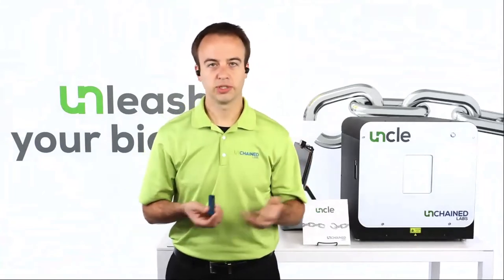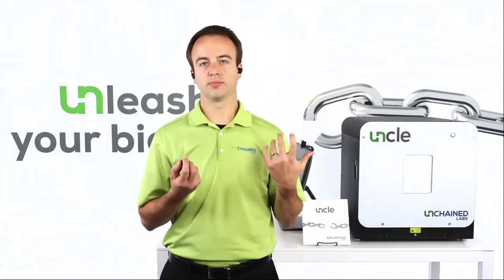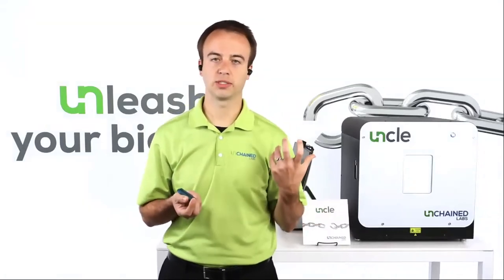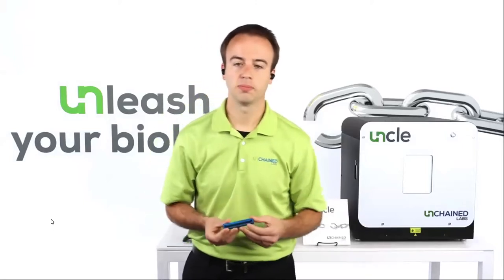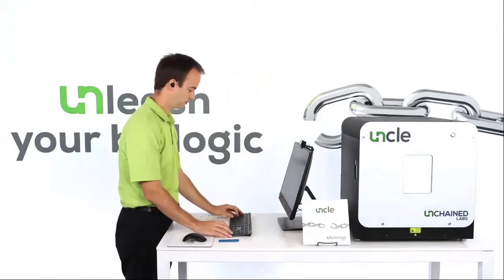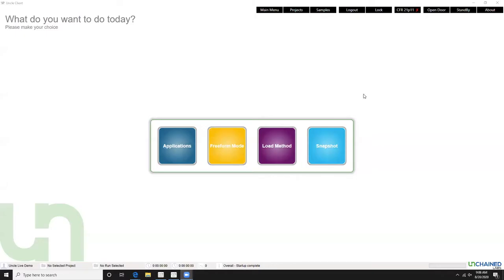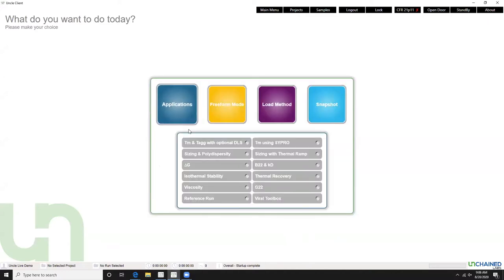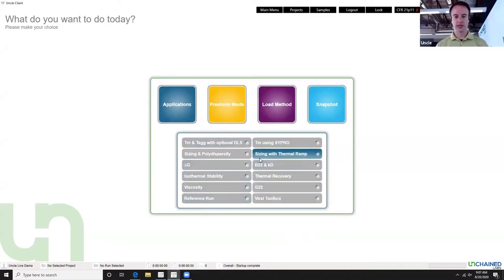Now I'm going to set up an experiment just to show you how easy and quick it is. Then we'll take a look at the analysis software of a previously run experiment using UNCLE analysis. To set up my capsid stability experiment, I'll go to 'Capsids' — after logging into the software, you'll first see all the different applications available on the UNCLE. This is a result of the three different detection methods and all the different ways we can combine them with the heating element on the UNCLE. Today we're going to be setting up a viral toolbox run — we'll select 'Capsid Stability in DLS' and pick our project for the live demo.